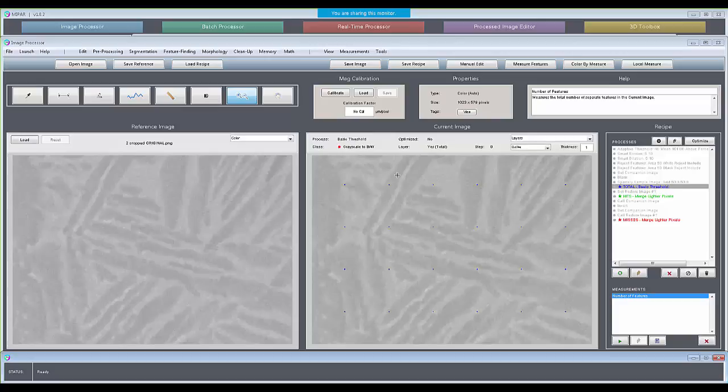So that's kind of taken us back through some other measurements. We showed local measuring. We showed some point count measuring. We had finished with the batch processing, and that just leaves the case of Z-stacks of confocal images. Well, we can work with Z-stacks to make reconstructions, and we can do random line intersections through those 3D reconstructions.